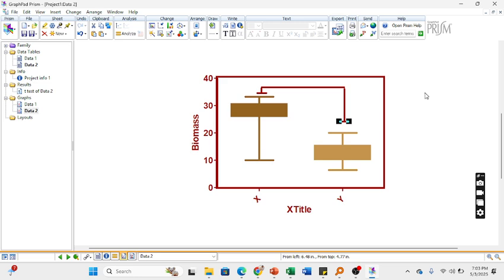I'm just doing it fast, so you can also verify it. Now we paste our values here.